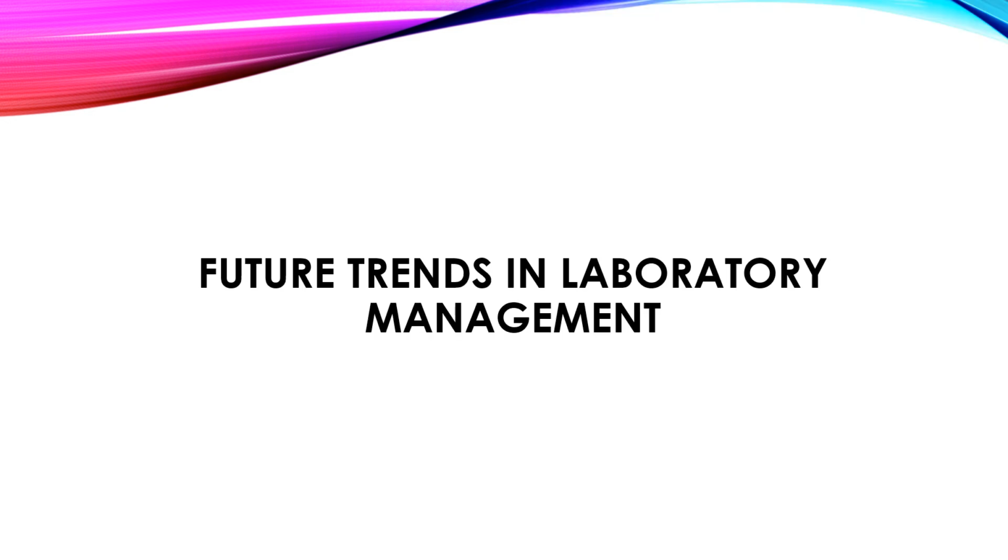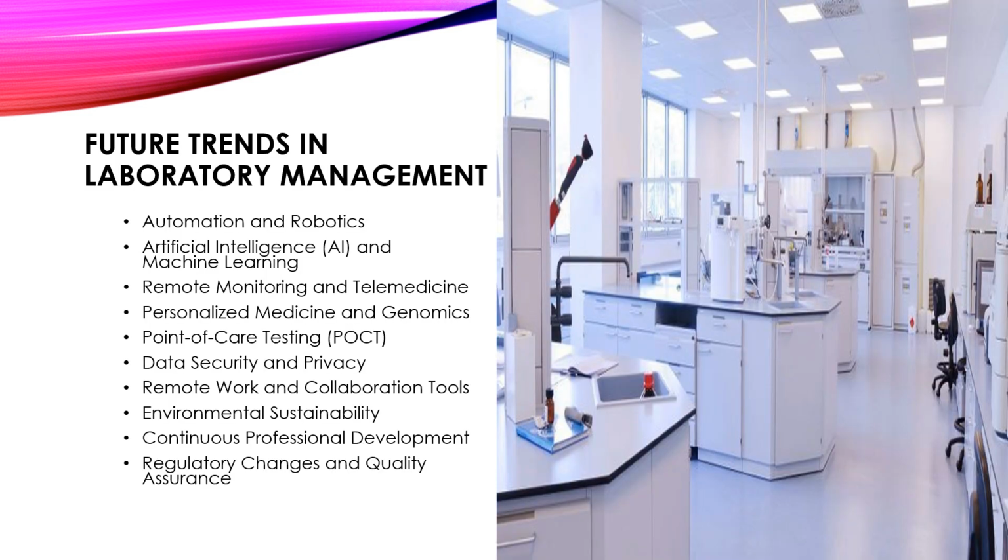Future trends in laboratory management. Now, predicting future trends in laboratory management involves understanding advancements in technology, changes in regulations, and shifts in laboratory practices. The following are several potential trends that could shape laboratory management in the future.